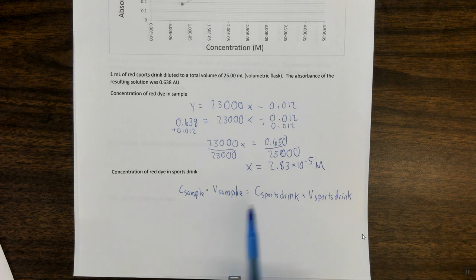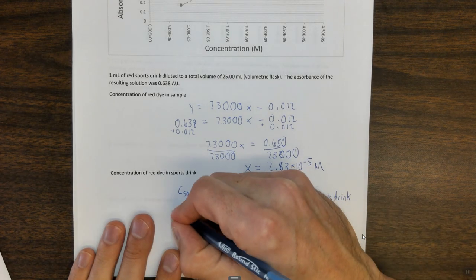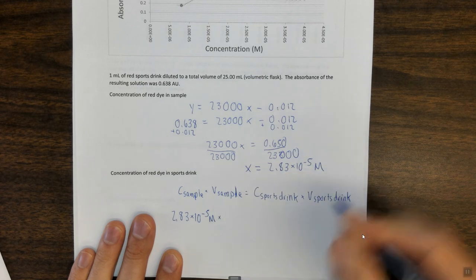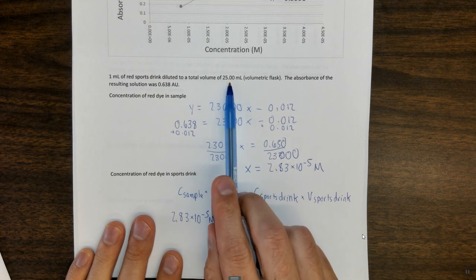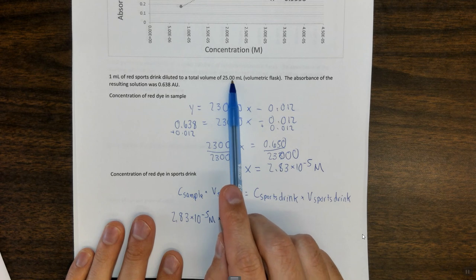Okay, now the concentration in the sample, that's what we just found a second ago using the calibration curve, 2.83 times 10 to the minus 5 molar. The volume of the sample was 25 milliliters. Of course, I didn't measure all 25 milliliters in the spectrophotometer because it won't fit in the vial. Only about 7 milliliters will fit in there. But it doesn't matter.